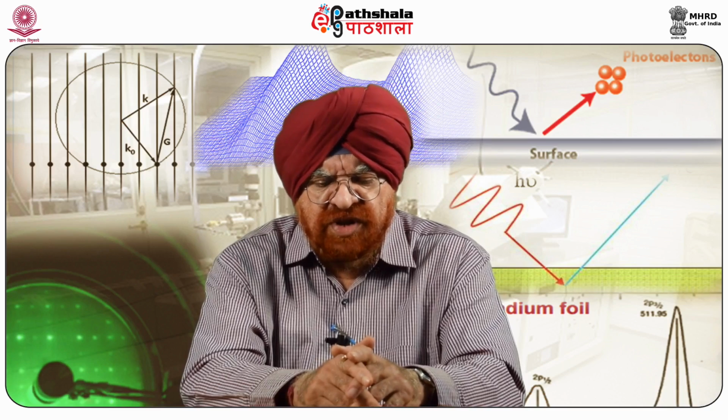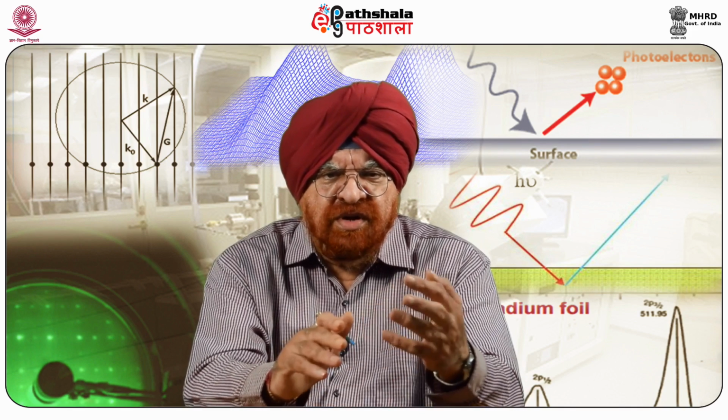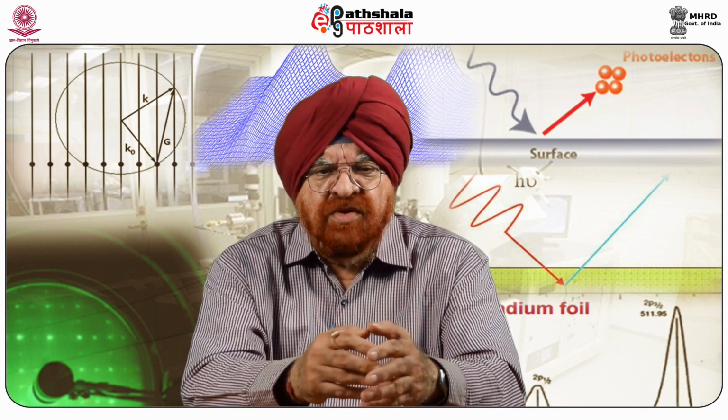So students, by now, when you have gone through this module, you would have understood the beauty of this surface analytical technique called ESCA. Now let us summarize what we have learnt here. ESCA spectra is obtained by irradiating a specimen with a beam of X-rays and measuring the kinetic energy of the electrons escaping from the top, usually from the 0 to 10 nanometer range of the surface film or from the surface of the material.